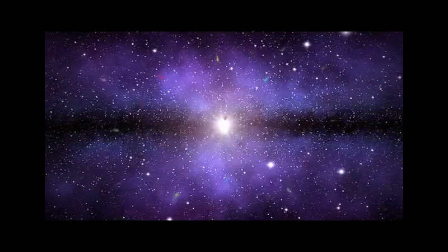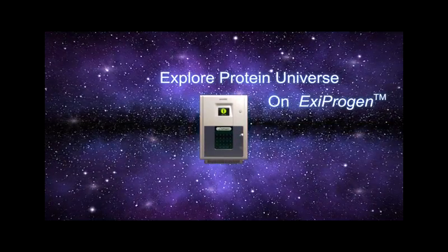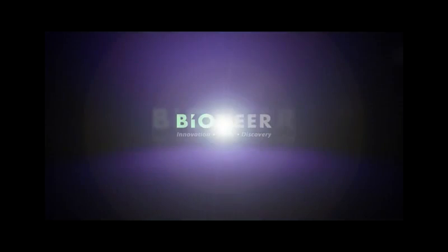There's an infinite universe of proteins out there. There are vast, unexplored protein functions awaiting you. Let Exiprogen take your research to new heights with far-reaching results. Be a pioneer in protein discovery with Bioneer.